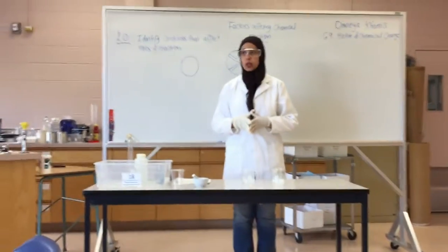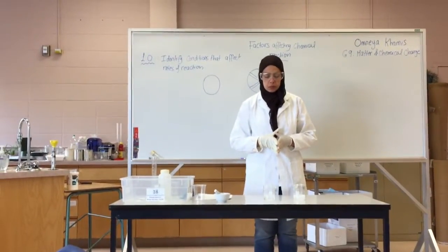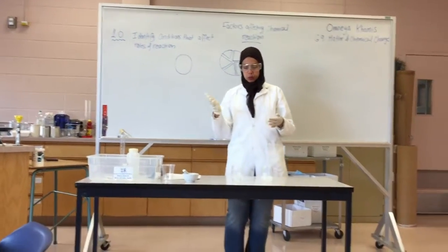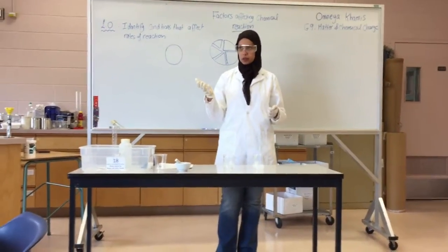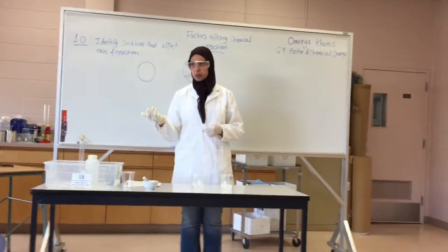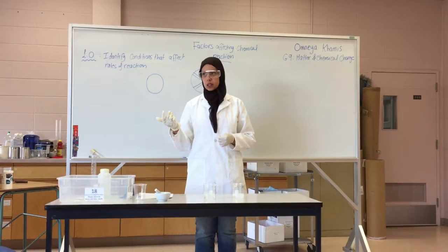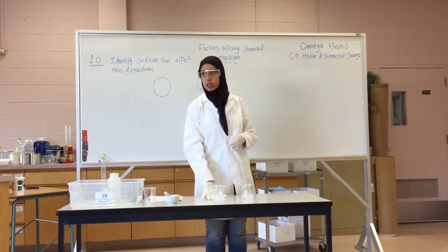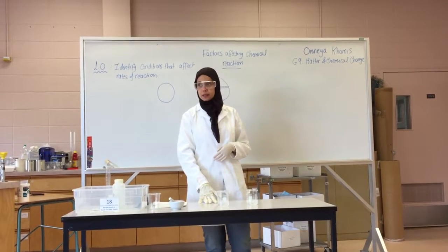Okay, so now you are recording the time. Okay, Holly, which one did you record? Well, I'm recording the crushed one. Okay, what was the time taken? We're at 1:04. Is there still gas, or is it done? No, the crushed one is done. Okay.